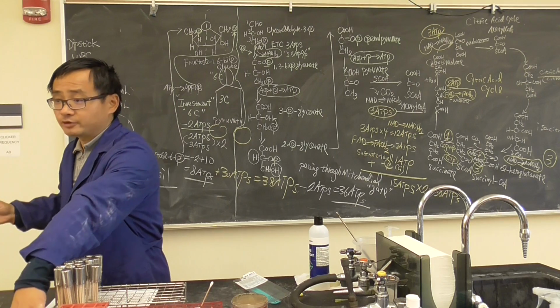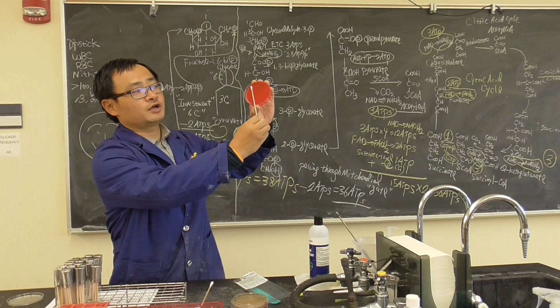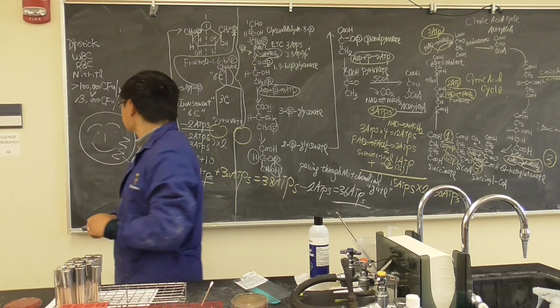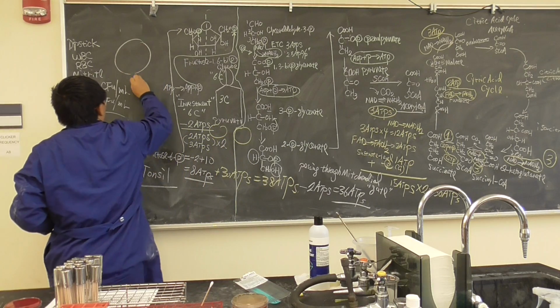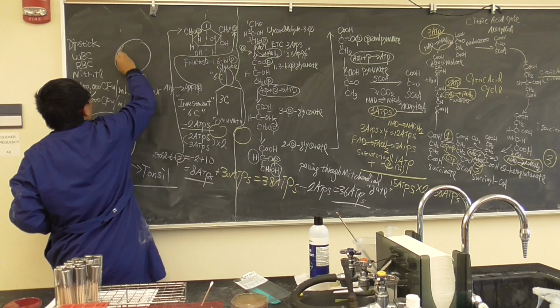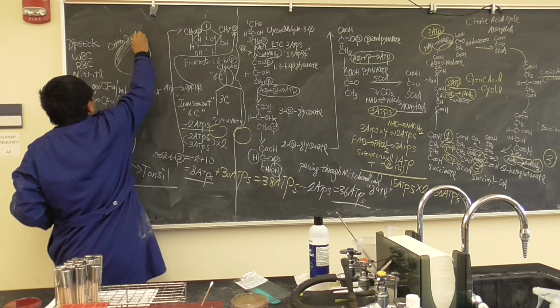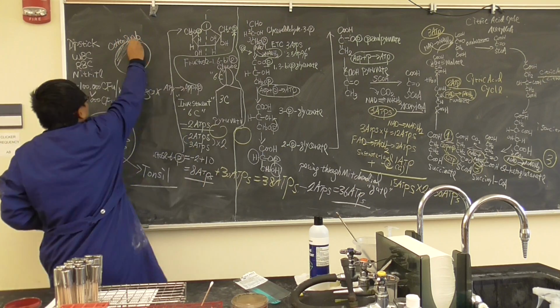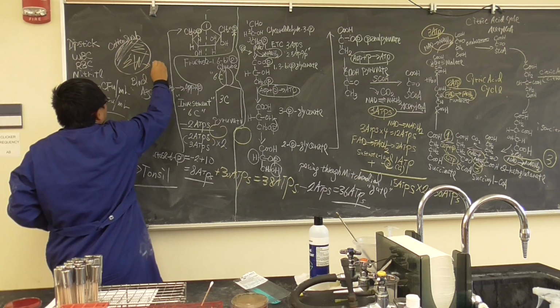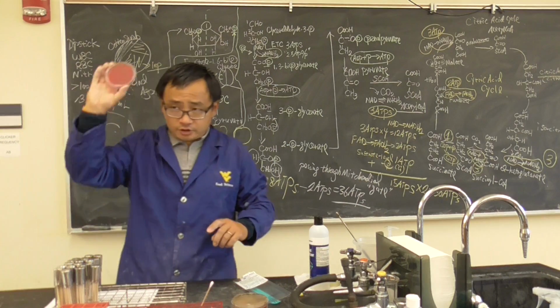What you do? Very simple, you have a blood agar. On the blood agar, you do a streak, a very gentle streak at the beginning. Okay, then you switch, use your loop. So we have a blood agar. This is the cotton swab at the beginning. Then here we're going to use the loop, okay? Then, once this is finished, what are we going to do?